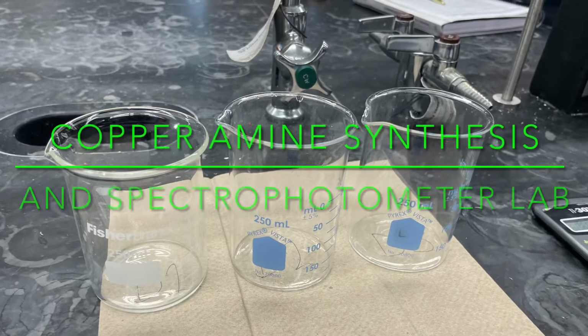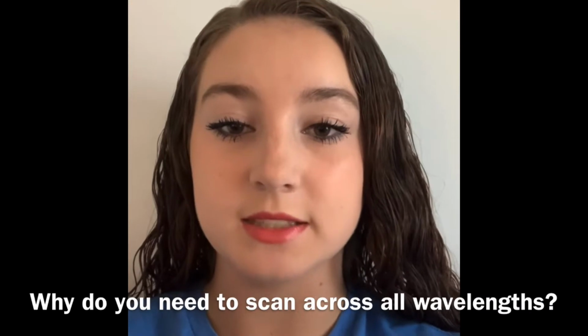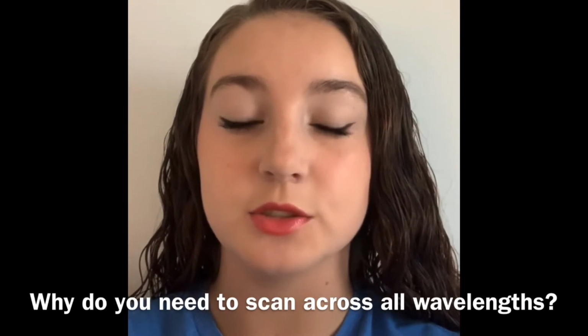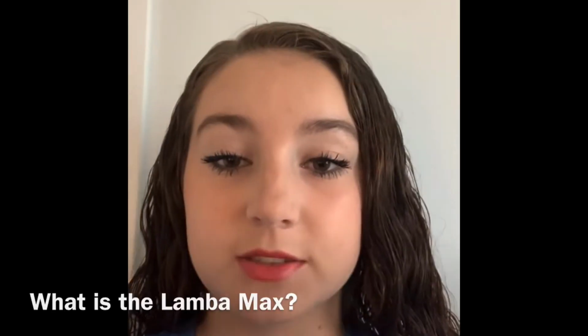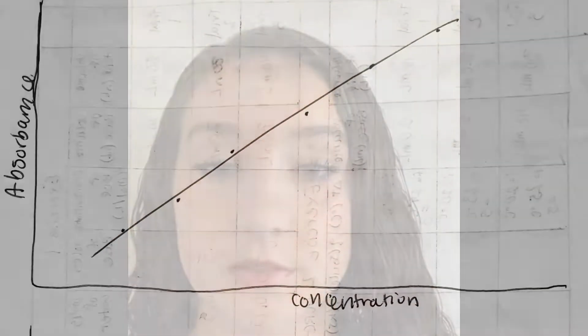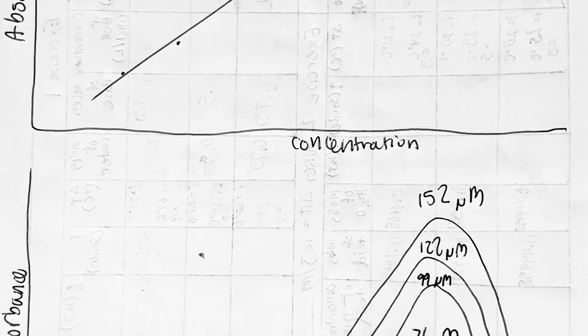Copper amine synthesis and spectrophotometer lab. Scanning across all wavelengths allows us to determine the best wavelength to use for our experiment. It also allows us to determine the lambda max. The lambda max is the wavelength where the most absorption occurs. The wavelength that achieves the maximum absorption will be the highest of all the values.